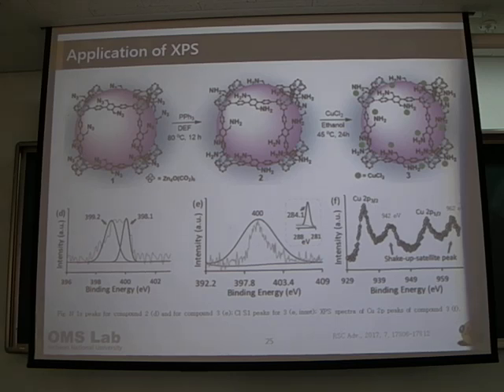Then you are just saying that the copper is a copper chloride. Of course, you added copper 2. And after coordination, how will the copper peak change? From copper 2 to copper 1? Yes. Sometimes if we insert the copper chloride, copper 1 is formed. Copper chloride can turn into copper 1, but in this case, this is copper chloride. That means this copper chloride compound doesn't break. It just binds with amine, and this is the information given by the satellite peak.